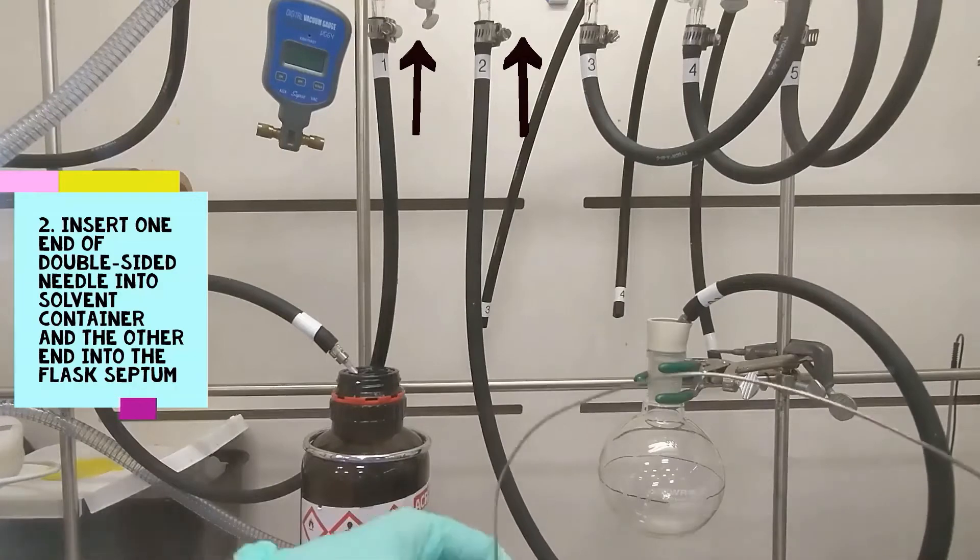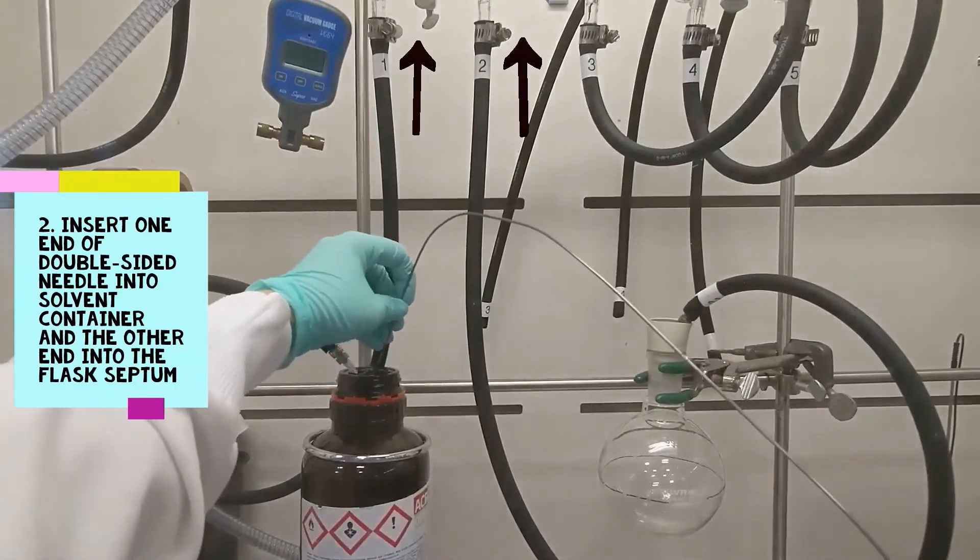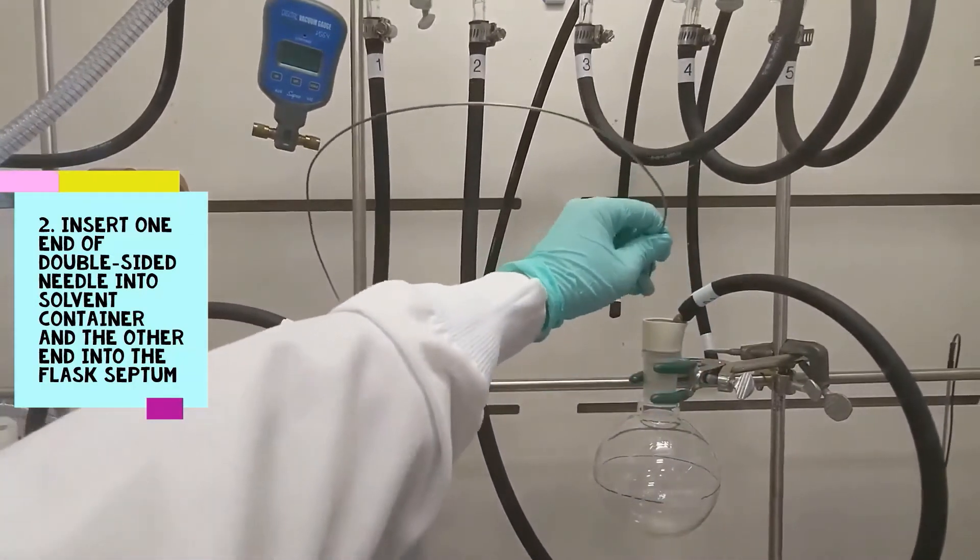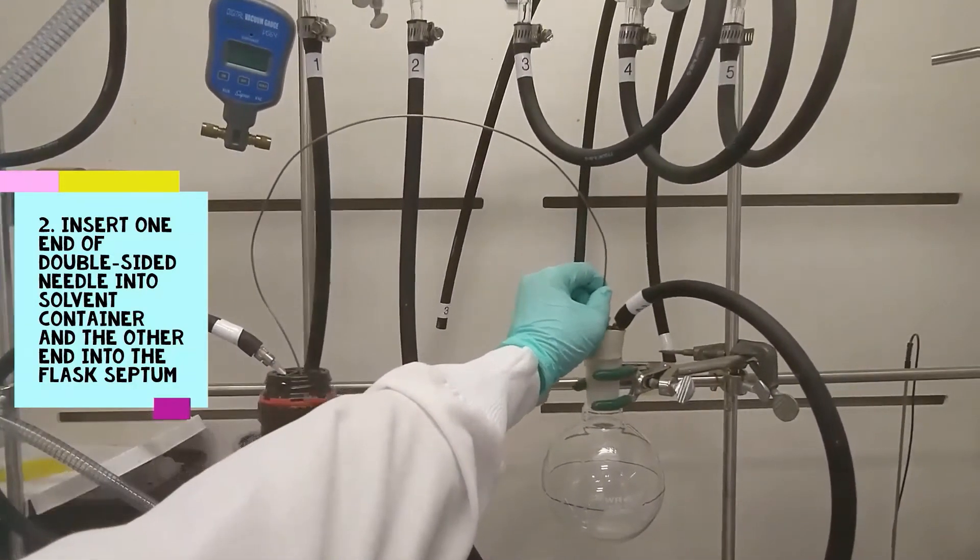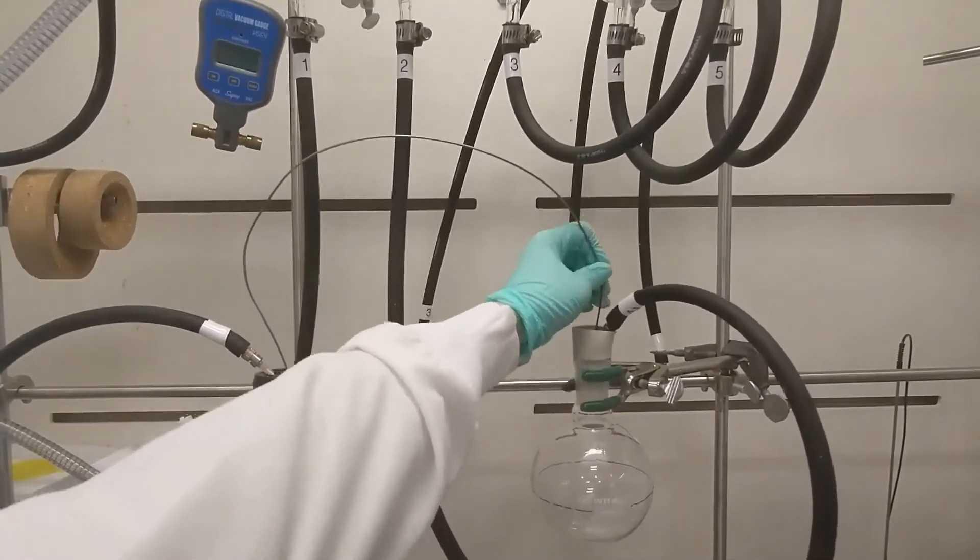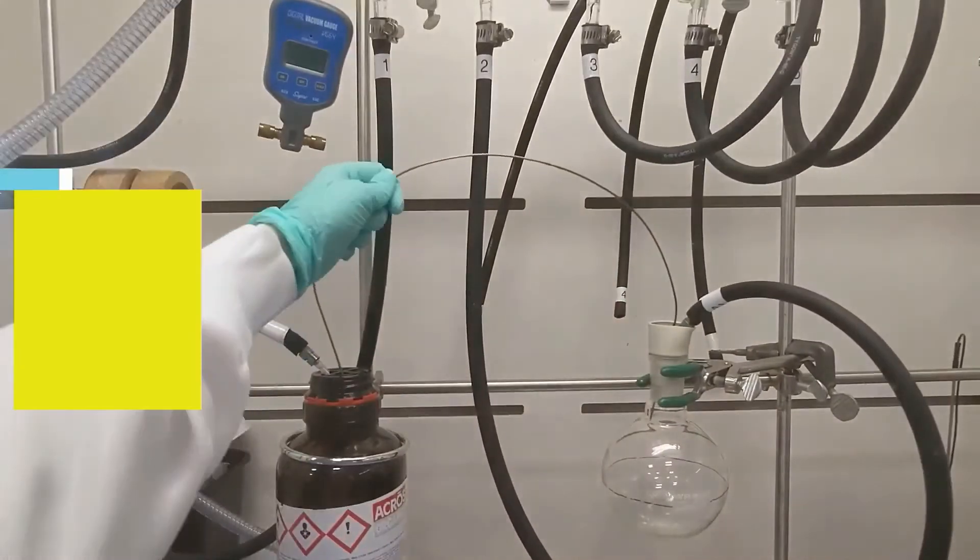Here, roughly 200 milliliters of solvent is being transferred. The black line on the round bottom marks where the 200 milliliter volume line is on the flask. In my reaction preparation, I usually measure out 200 mils, or however much volume I wish to transfer.